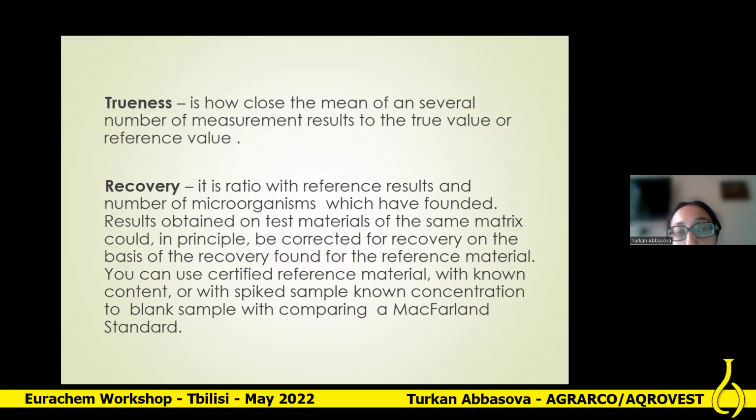Time by time, laboratories should provide quality control, such as interlaboratory quality control. Recovery is a ratio with reference results and the number of microorganisms which have been found.